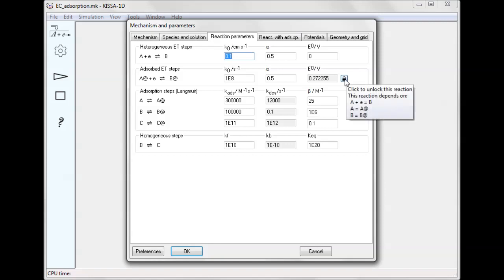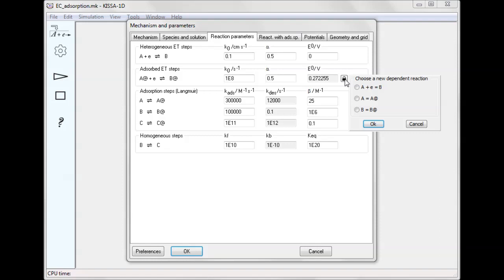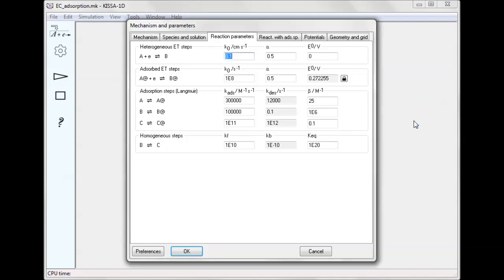This is because the thermodynamics of this reaction are dependent on other reactions and are calculated automatically. The list of reactions defining the value of E0 can be seen by clicking the lock button. Any one of these reactions can be made dependent instead of the electron transfer step, if necessary.